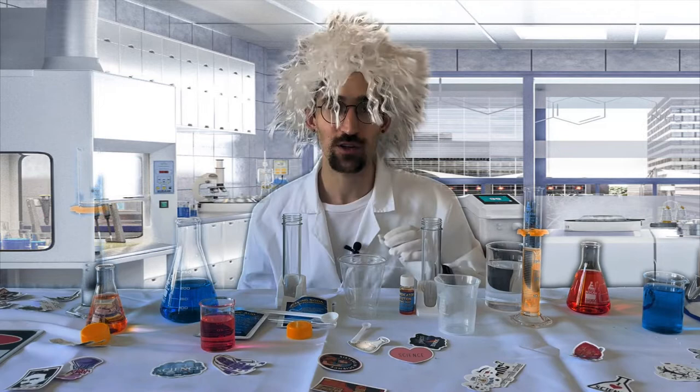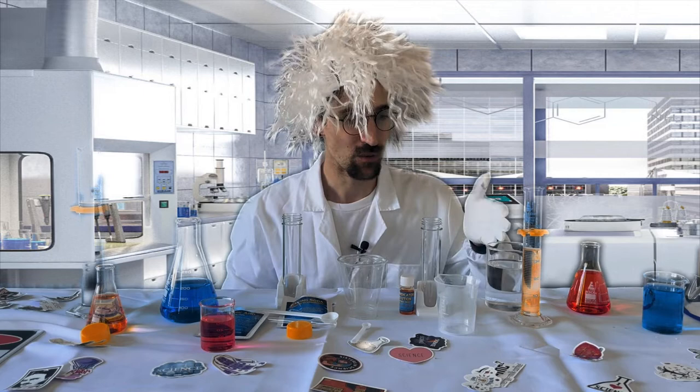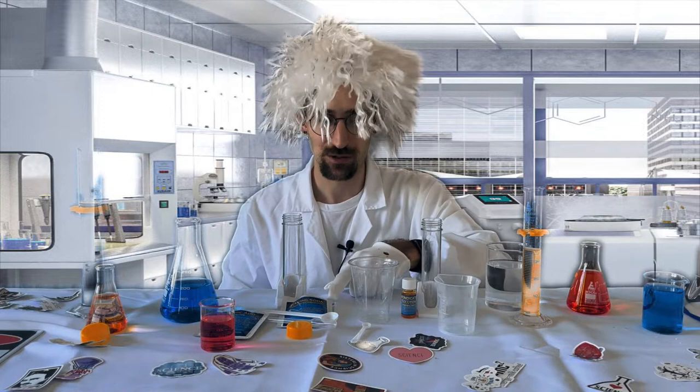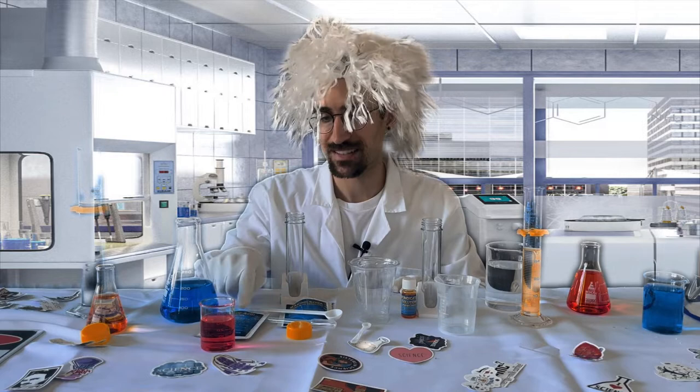This experiment is going to entail water, your beaker included with the kit, a test tube, the phenol red which is an indicator solution, a cup, baking soda, another test tube, your scooper, a pipette, and the citric acid — and that's everything you need.